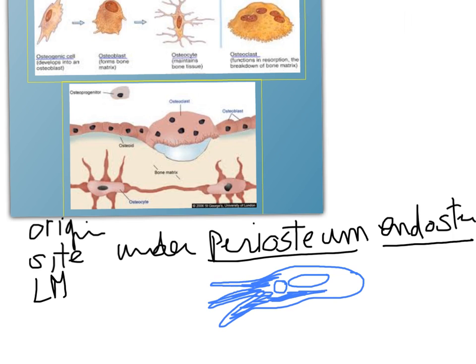This means a well-developed Golgi, and this means also that the cell here is forming proteins in large amounts. So here we have an oval cell with few processes. This is the shape. As regards the cytoplasm, it is deeply basophilic and showing a negative Golgi image.